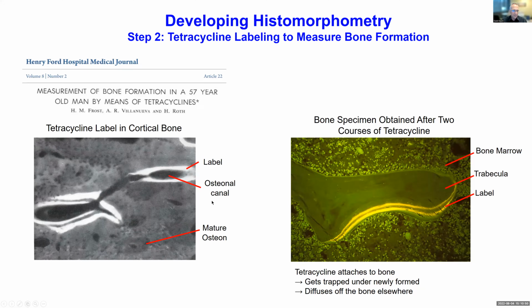And that's quite interesting, actually. So Harold Frost, he noticed that tetracycline is attaching to bone and can be visualized under fluorescent light under the microscope.